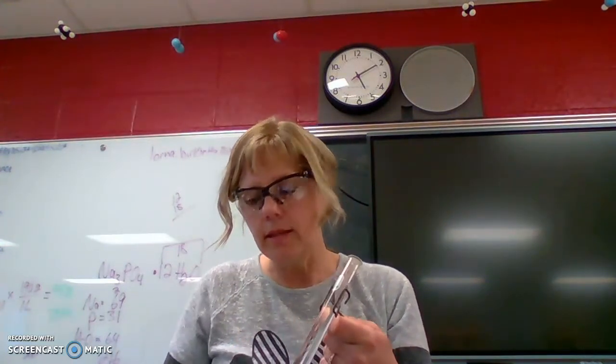Because there's condensation, a byproduct of that combustion of the alcohol was water vapor. And that's really important. So the observation is that we see this condensate. Again, this has to be very cold. So we know that one of the products of that particular reaction is just water vapor. And that's really all we see with this. And that's the last one.